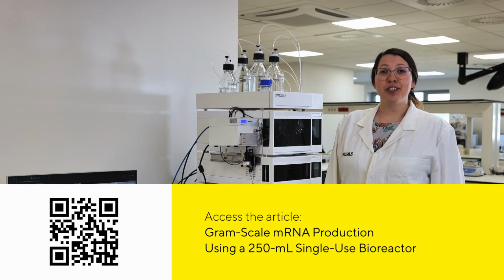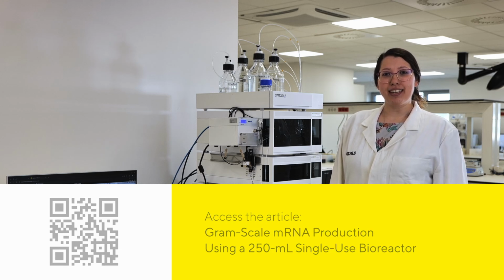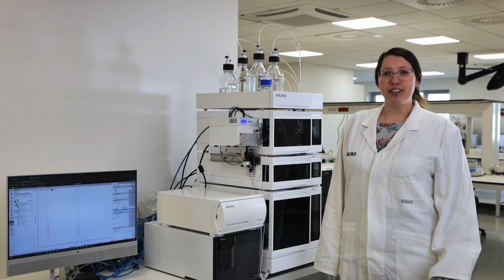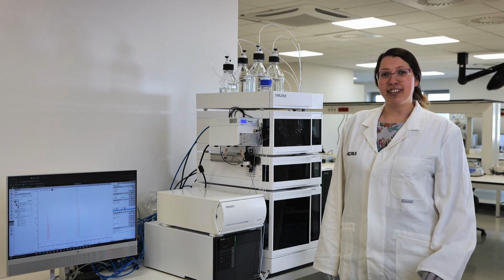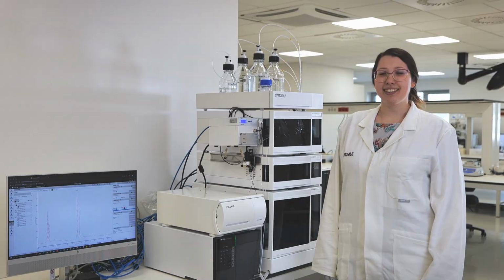Additionally, when trying new protocols, buffers, or reagents, we can act quickly if we notice that the reaction is not producing any mRNA. By monitoring the reaction in real time, we can attempt to correct the IVT by adding specific reagents, thereby gaining a better understanding of the process and potentially salvaging the IVT.